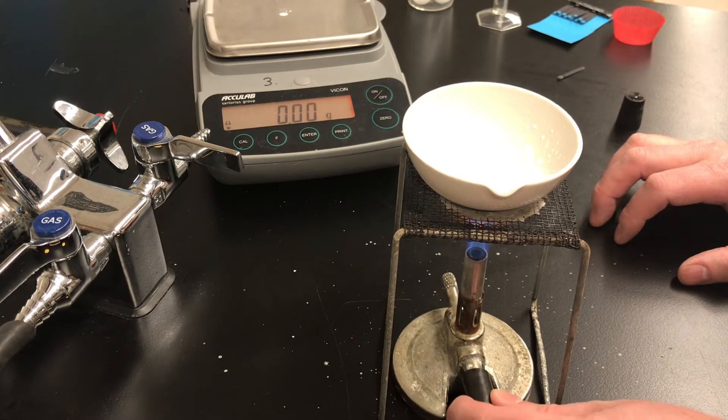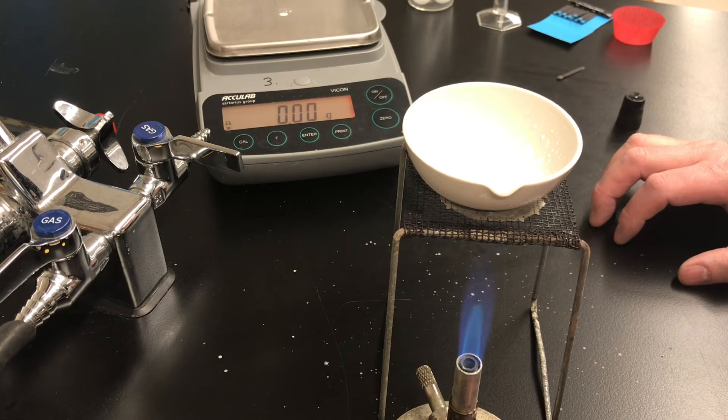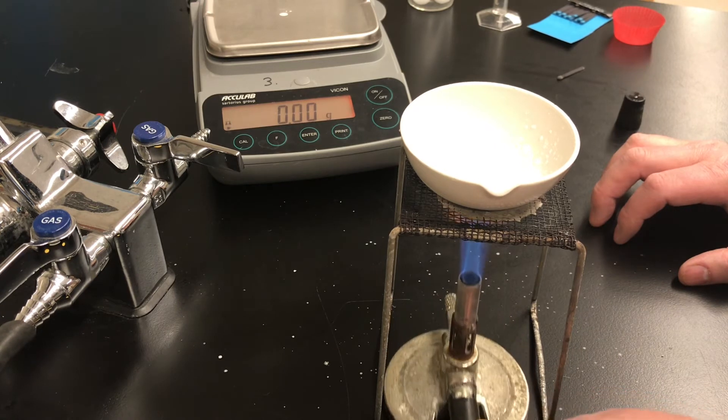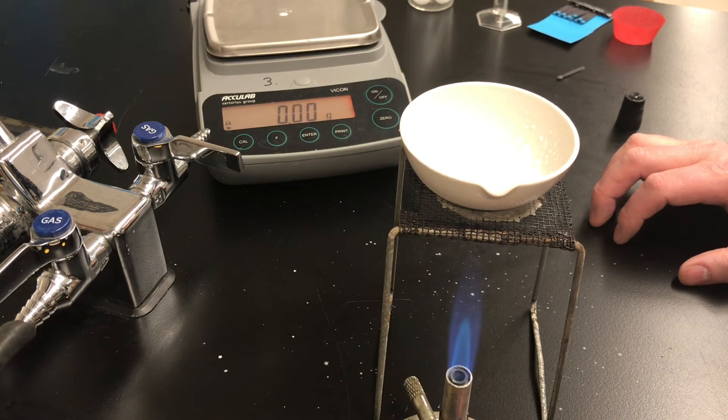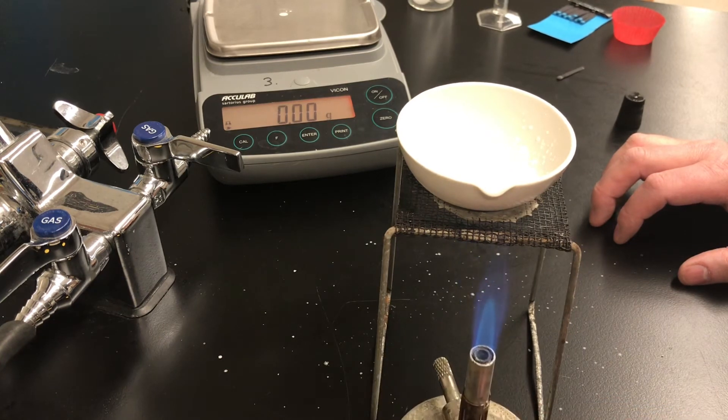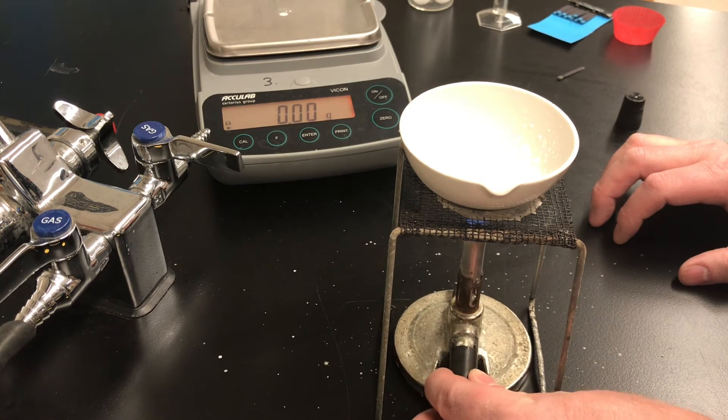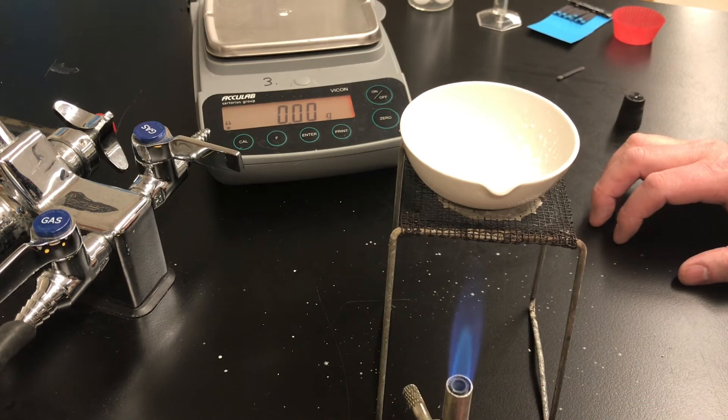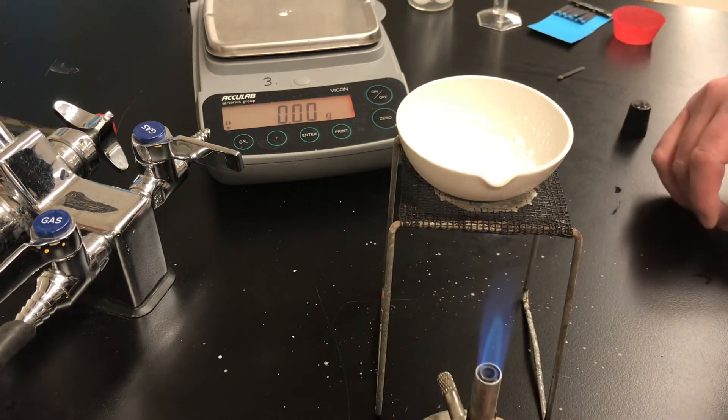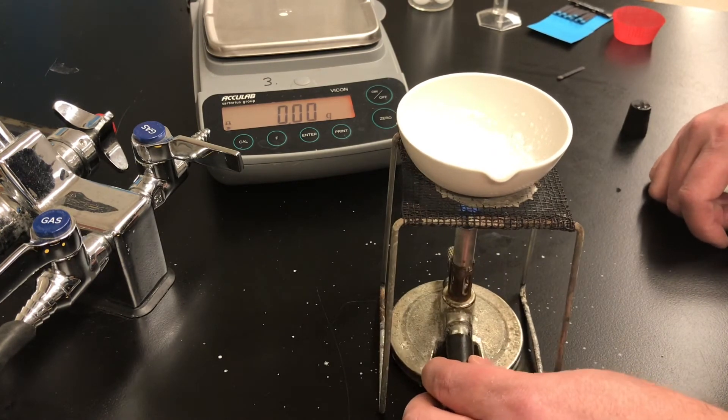If the salt spits out of the dish you're losing salt. On the other hand if water remains in the dish because you don't heat it until it's completely dry then it will appear as though the mass of the salt is heavier than it should be. The water that would be left in the dish would make it appear as though the salt's mass were too heavy. So one error loses mass, the other error gains mass. Think about how that might affect your final result.